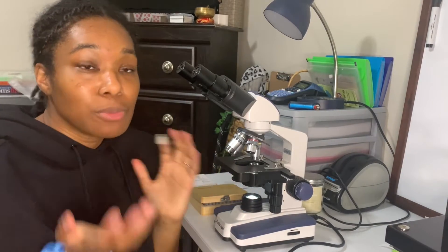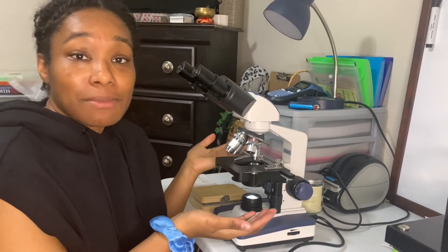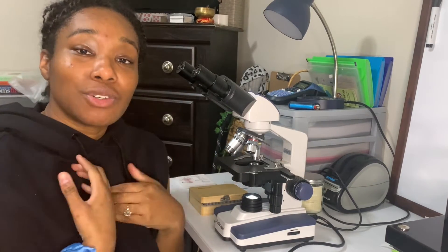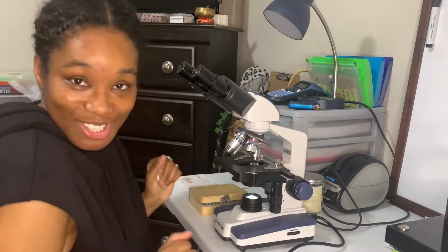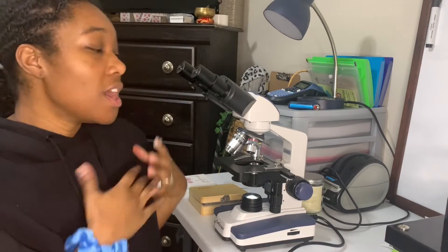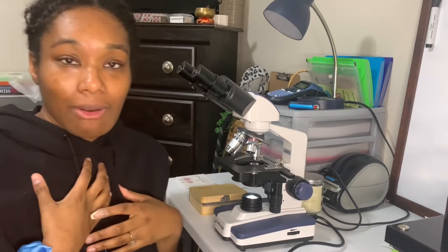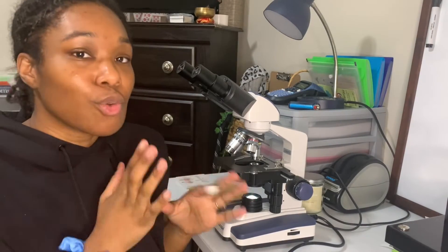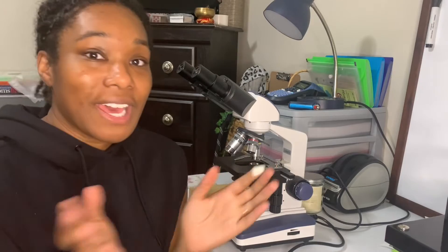What you just saw was the Amscope tutorial of the Amscope microscope. Right now, what I'm about to do is just do a little hands-on tutorial myself with this microscope — how I like it, what the features are, and what I think about it. There are a lot of questions that have been asked, so I want to address certain questions. Let's go ahead and get into it.